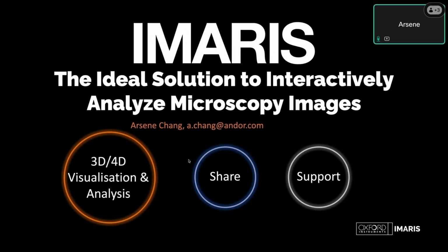Also, IMARIS provides the tools for you to share your research results, and also comes with a team of people that are here to help you all along your image analysis path.